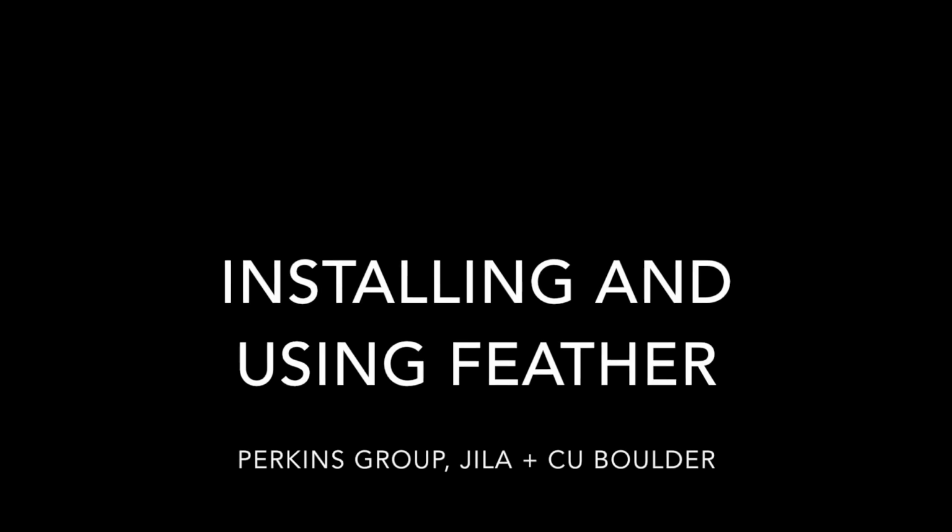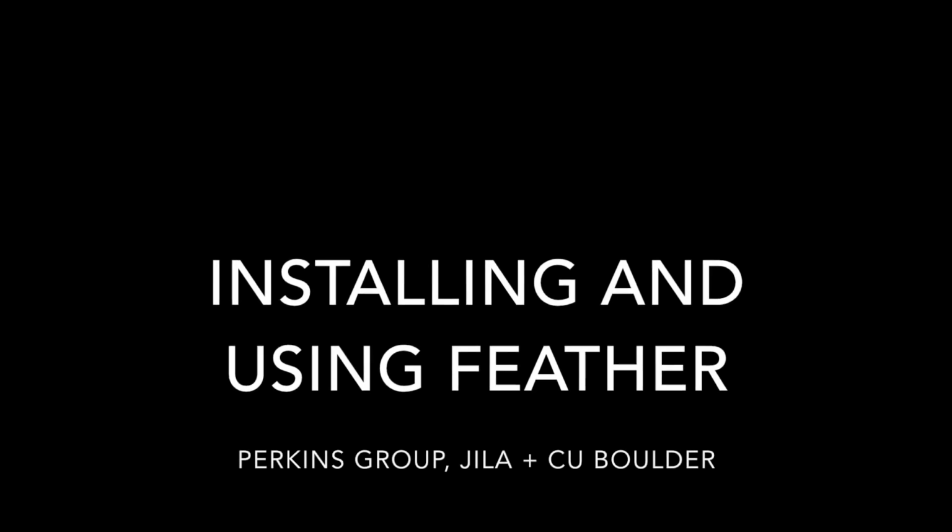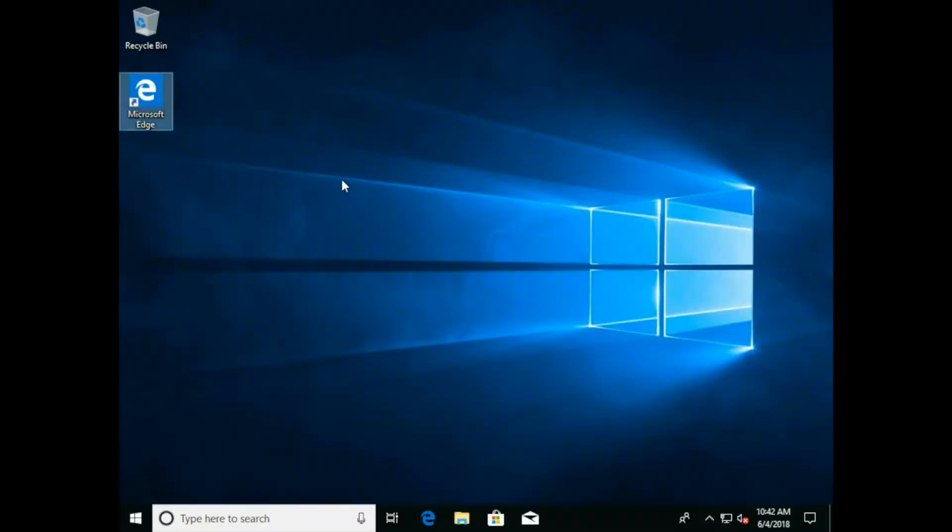Hello and welcome to the tutorial guide for using Feather, which is a single molecule force spectroscopy tool. So first we're going to talk about how to install dependencies for Feather.